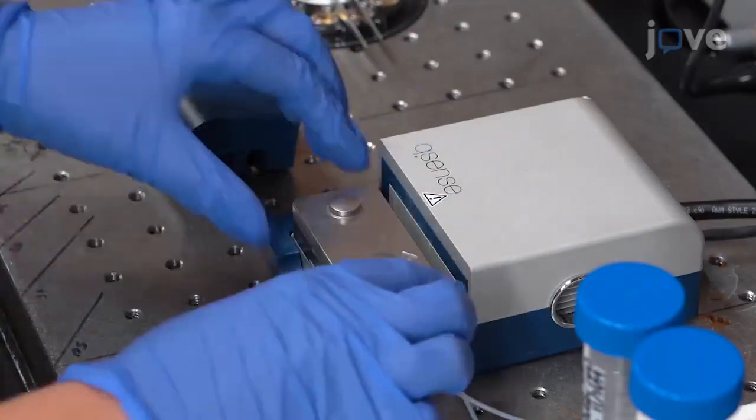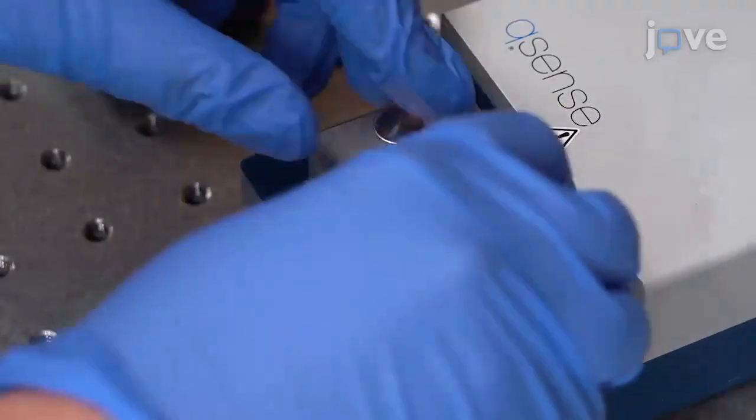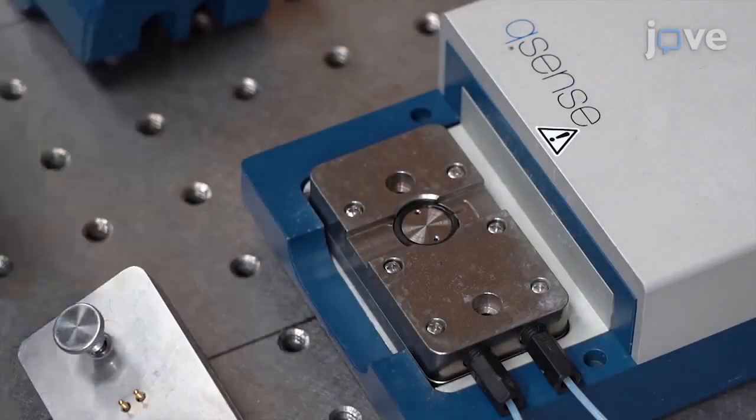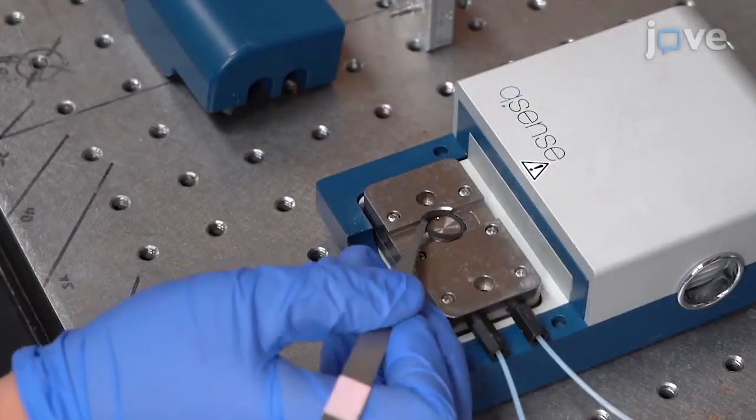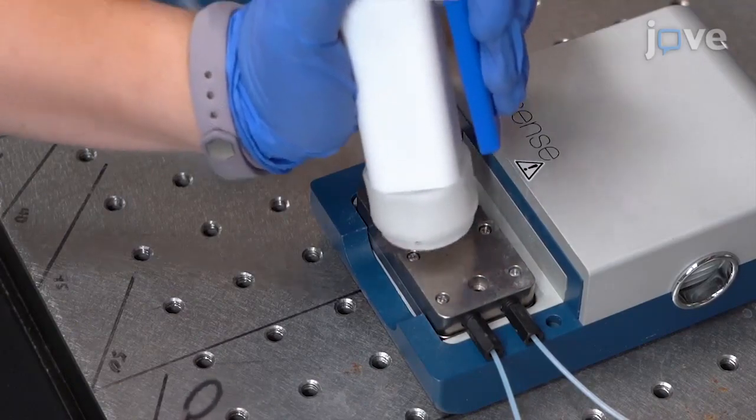After turning on all necessary equipment, remove the flow module from the chamber platform and unscrew the large thumb screws to open the module. Dry the O-ring on the flow module with a stream of nitrogen gas and check that the O-ring is lying flat.